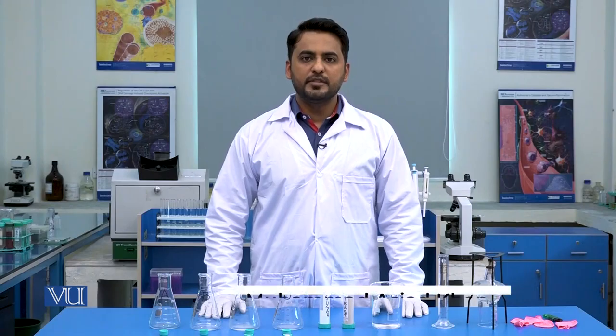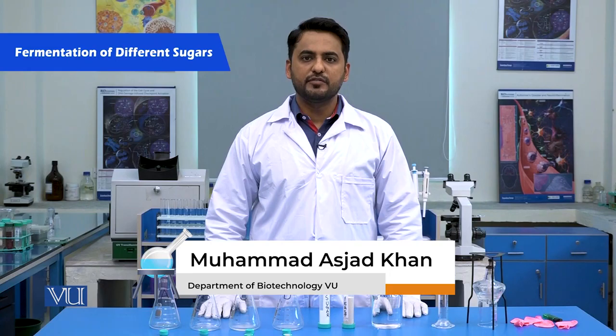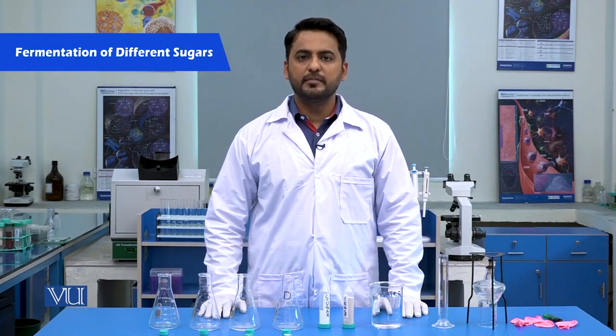Dear student, my name is Mohammad Asjad and today we are going to perform an experiment named fermentation of sugars. Fermentation of sugars can be performed by using different microorganisms like bacteria and fungus. But today we are going to perform sugar fermentation by using yeast.